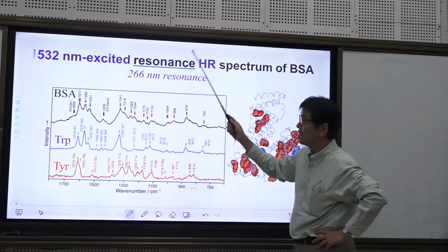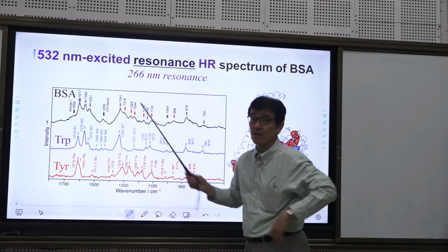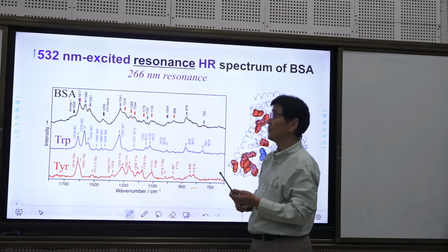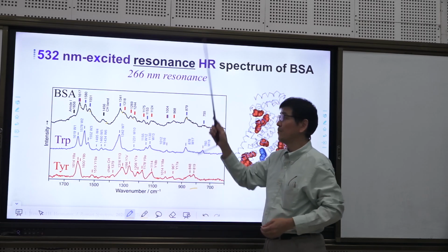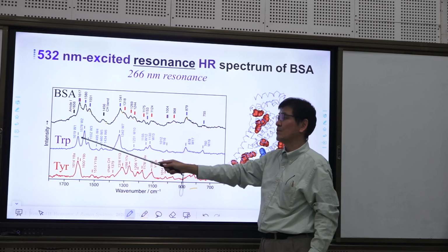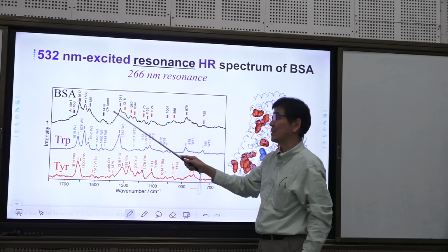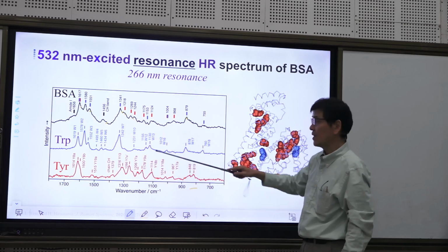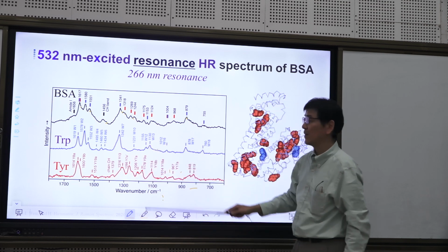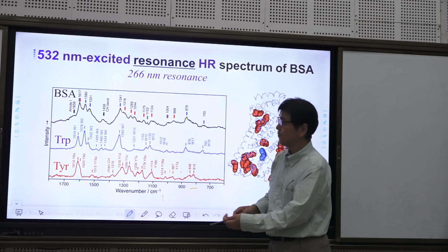And as I explained, BSA, bovine serum albumin, contains tryptophan and tyrosine. So we expect the resonance hyper-Raman signal of tryptophan and tyrosine should be included in this result. So I put two results of tryptophan and tyrosine hyper-Raman signals. Let's compare.